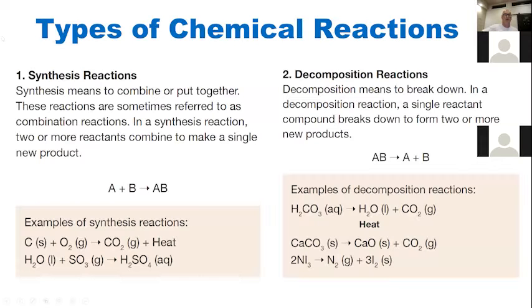So let's review some of these. The very first one we're going to be doing is a synthesis reaction. You're going to be using steel wool. And what's going to happen to the steel wool? What is the synthesis reaction for that one? What's the reaction for the steel wool? What are we synthesizing?